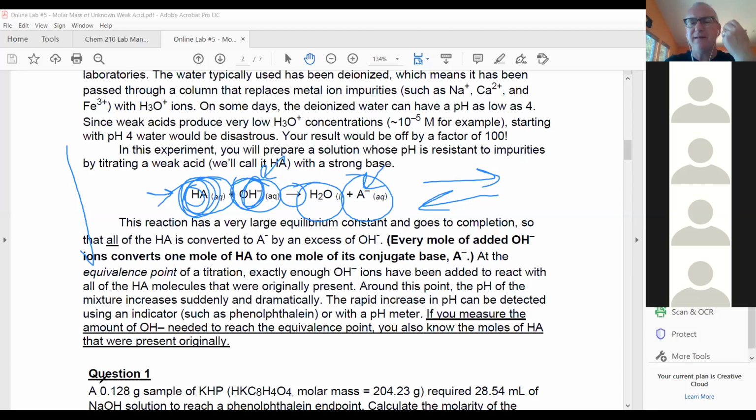Yeah, so there've got to be some questions about this. Any questions? Yeah. Basically, you said if it's a strong acid, the reaction will happen, but if it's a weak acid, it will not, like there is no change.